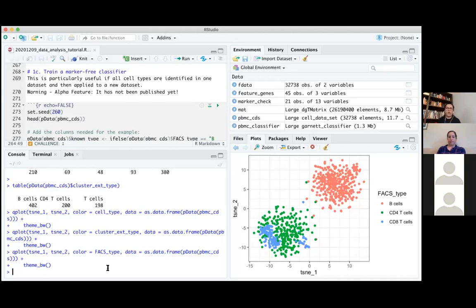And you don't know a lot about your markers, and you have no information to give to your marker file, and that's fine. You can just give a very broad cell type in your marker file, and it will still work for you. So let's see how to do this.